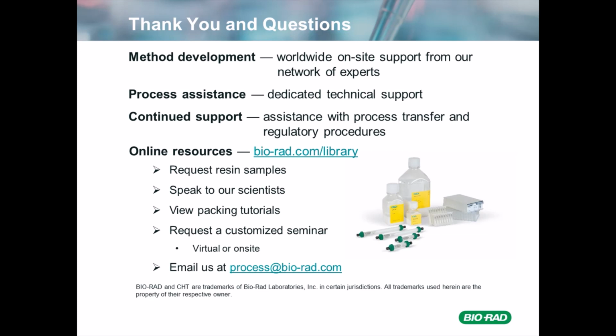No, so that peak is just during the HETP test itself. During actual processing of the column, you will not see that.